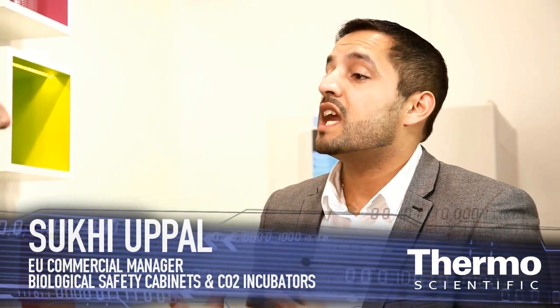Suki, talk about the Thermoscientific Heracell unit that we have here at the show. So the Thermoscientific Heracell 150i that we have here is our leading unit. And the reason that we wanted to have it here today at Analytica is to introduce a new technology that we've pioneered, known as IonGuard.